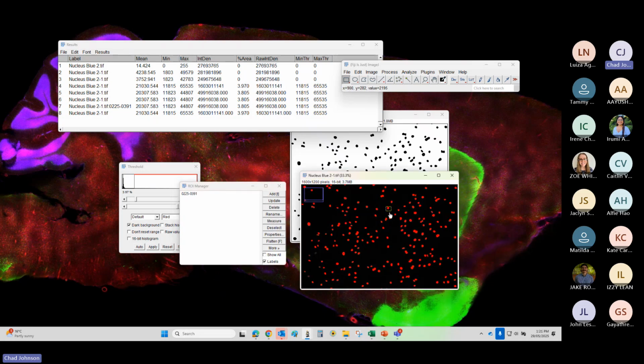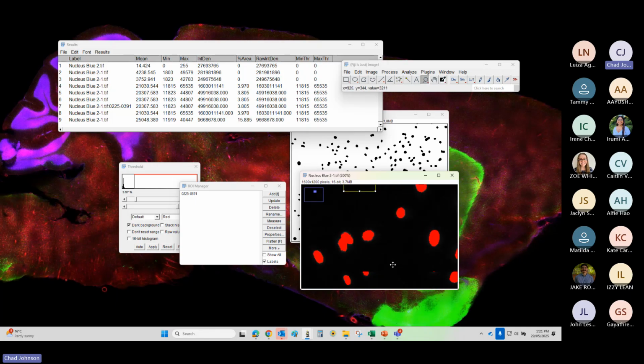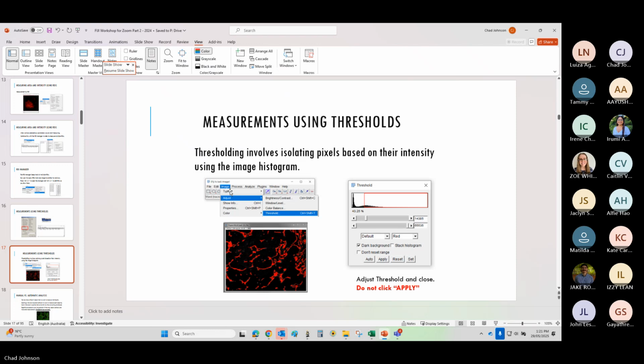So if I select that small area, approximately what, 30% of that? There we go. Okay, actually 15%. So 15% of that threshold is taken up within that ROI. So that allows me to use both a threshold as well as an ROI to isolate that measurement from the rest of the image. By isolating those values, you can get those measurements very specifically.